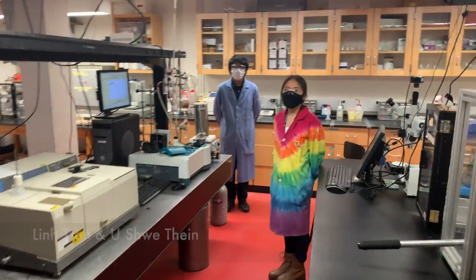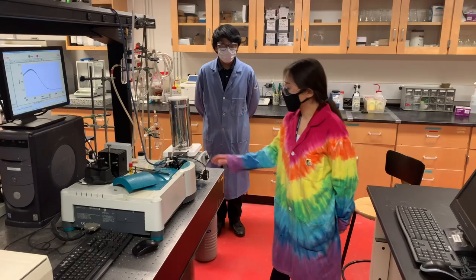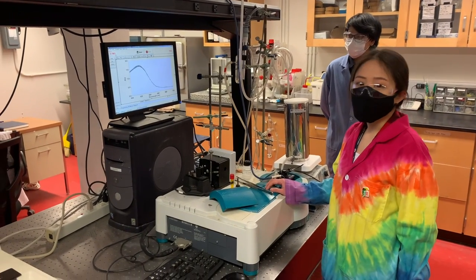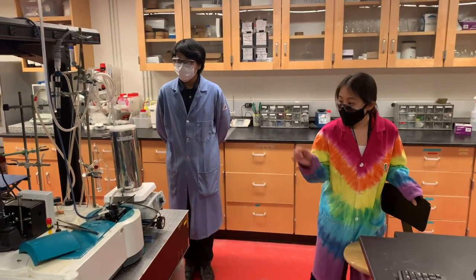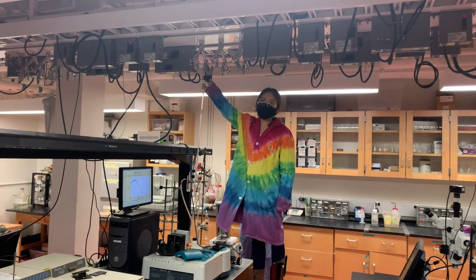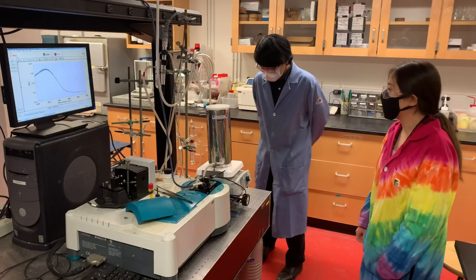It has a more sensitive detector in order for us to detect low levels of phosphorescence for our compounds. Hello, my name is Lin. I'm Yushin and I study small molecule activation using tetrapyrrole compounds. We use the cryo-unibus to study low temperature conditions, which allows us to study the kinetics of small molecule activation. This device uses nitrogen to cool the UV-vis cuvette holder, and I turn on the nitrogen myself and pour the liquid nitrogen in.